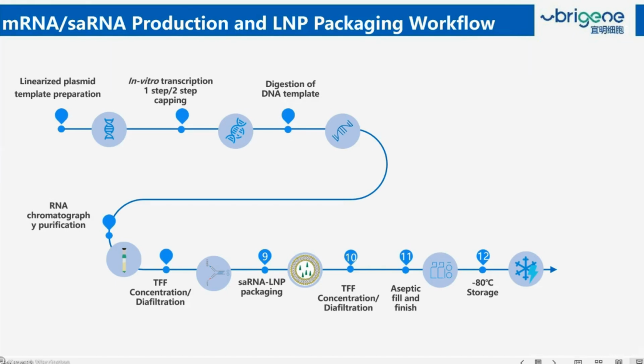Similar approach: linearized plasmids are used in in vitro transcription reactions with the second step of capping. We digest away the DNA template. We have established RNA chromatography purification schemes, the ability to then use TFF to concentrate and buffer exchange, and then package as part of the workflow.